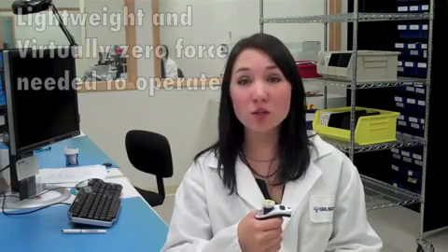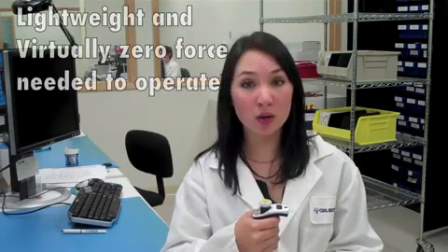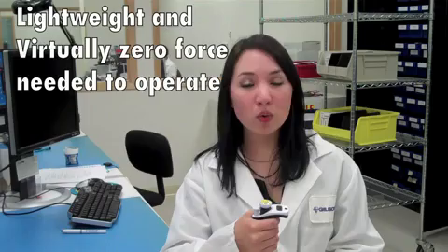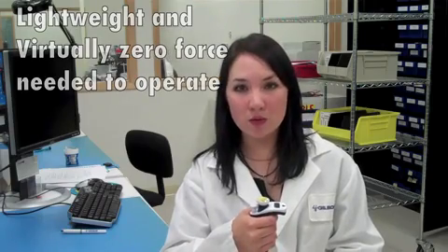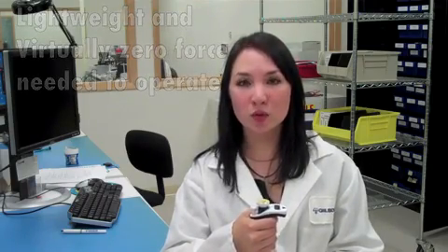There are two main features that contribute to the Pipetman M being ergonomic. It's a very lightweight pipette, the lightest weight motorized pipette on the market, and the motor eliminates pipetting forces, so there are virtually zero pipetting forces.